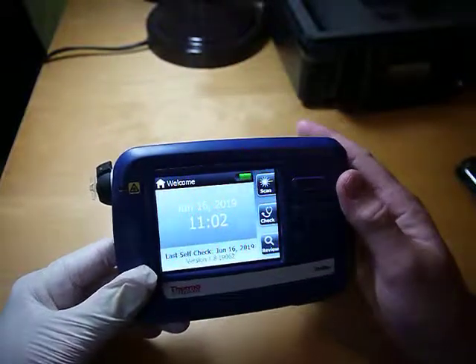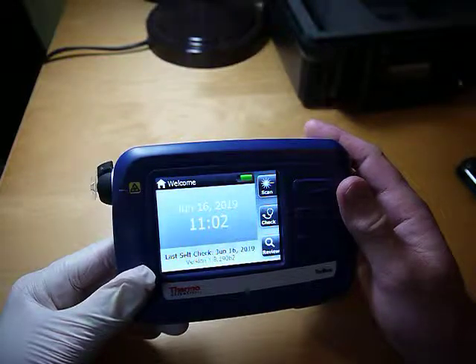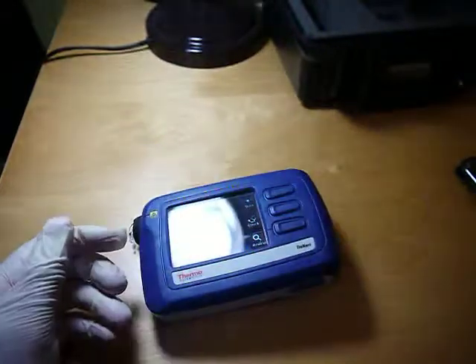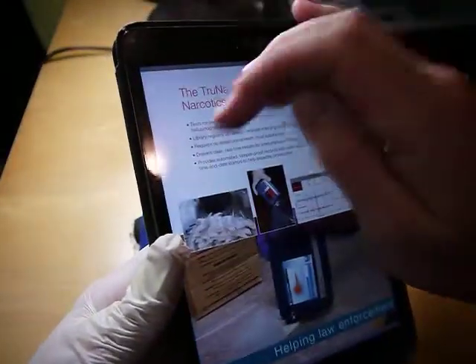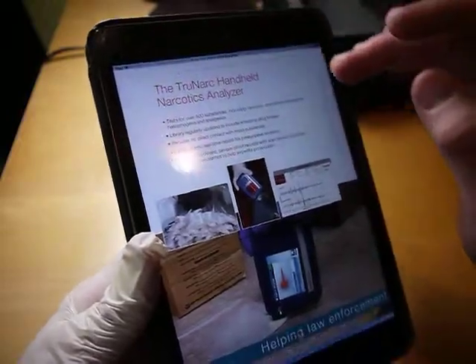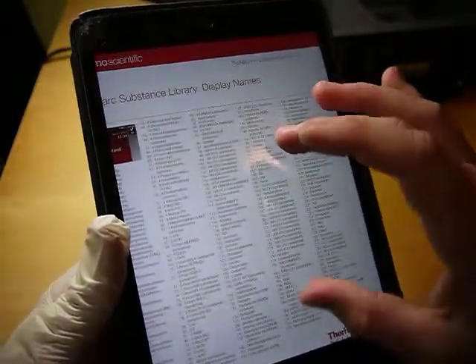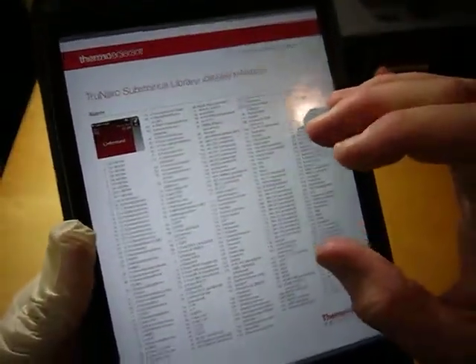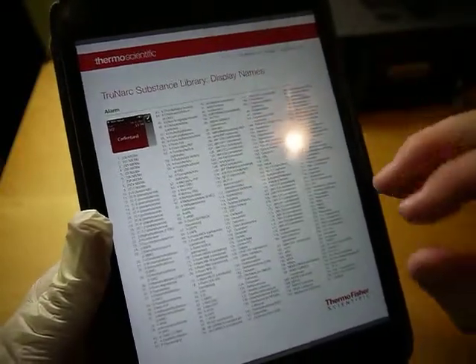The big thing about this is that it's an analyzer designed — it's not designed to pick up everything. It has a library, and the library is updated on a regular basis, so you've got a lot of different chemicals. This one was from August 2017, but it's updated on a regular basis.